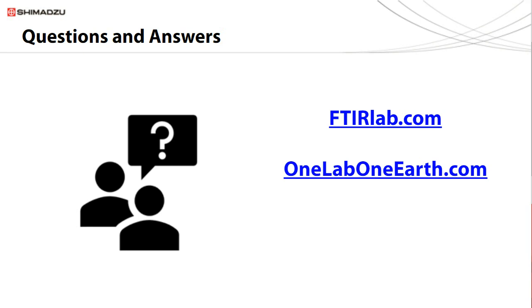So the short answer is yes, but let me elaborate. The libraries that are included by Shimadzu are what we call protected, just so that they were built to a certain specification and are there as a complete package that is provided. However, creating your own libraries and making the software look into your libraries and ours together at the same time is super simple.